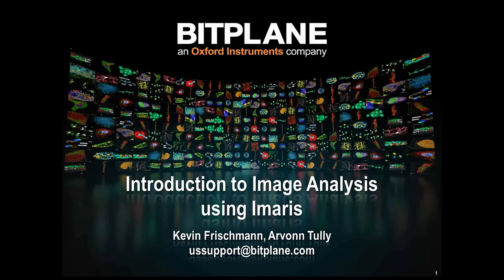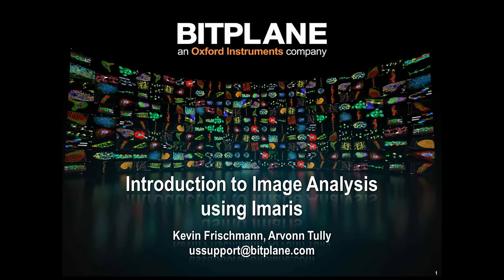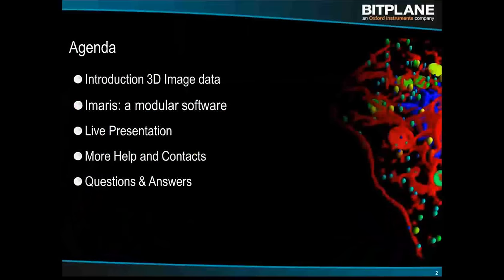With that in mind, we'll try to keep things moving fairly quick for the introduction to Imaris, sort of tutorial portion in the beginning. It will be recorded, so if anything is moving too quickly, you can always come back to the recording and, of course, ask questions later. So thanks again for attending, and with that, we'll go ahead and get started.